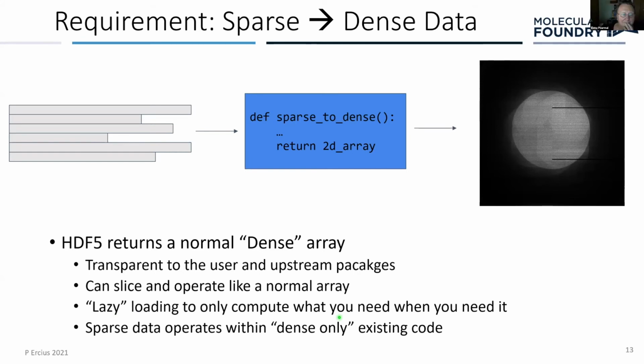You can leave the sparse data either in memory or on disk. And then if you need a frame, it blows that frame up, you operate on that frame, and then throw it away. Otherwise, you have to load all 650 gigabytes of the data set.